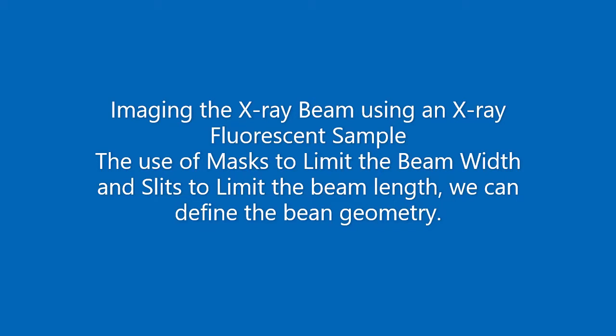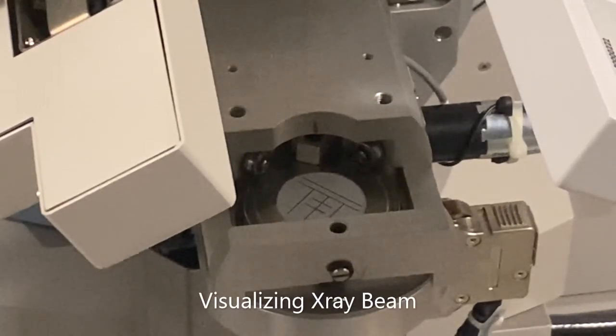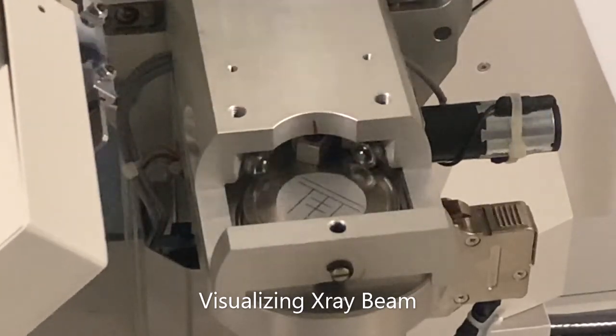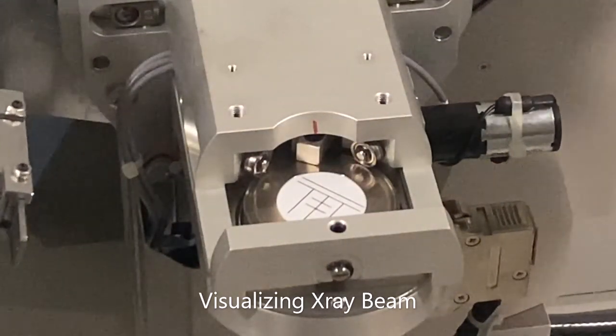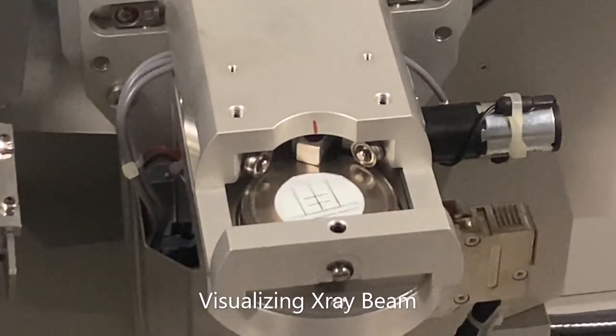Here we show you a specific sample that's used to image the X-ray beam. The sample is a surface coated with a fluorescent material that when the X-ray beam impinges on that fluorescent material, the material converts the X-ray energy into visible light. So we're going to turn off the light inside the unit and allow you to visually see the X-ray beam hitting the sample. In this case, the sample is also going to be rotating so that we can create the largest number of different orientations for our powder diffraction sample.